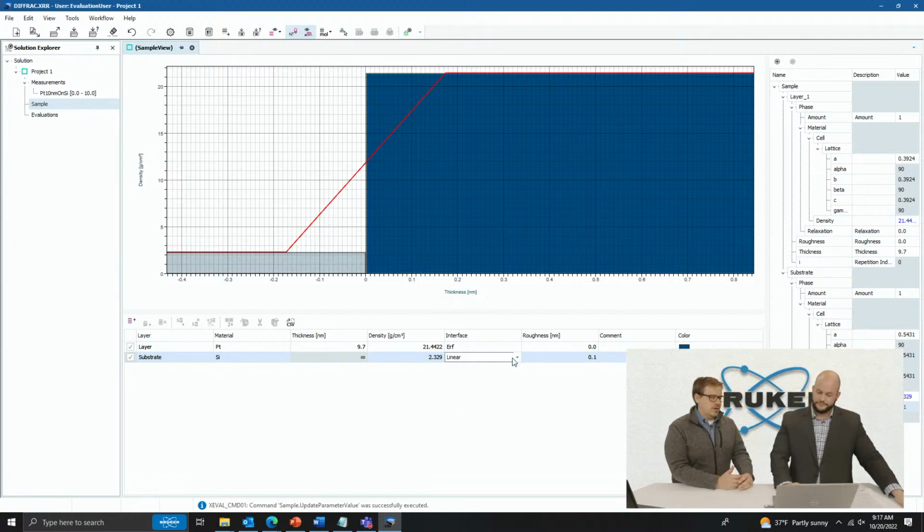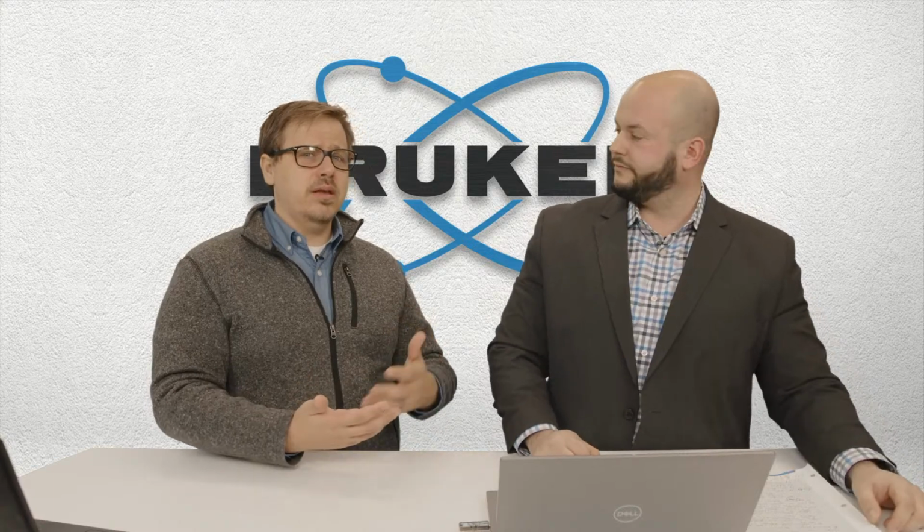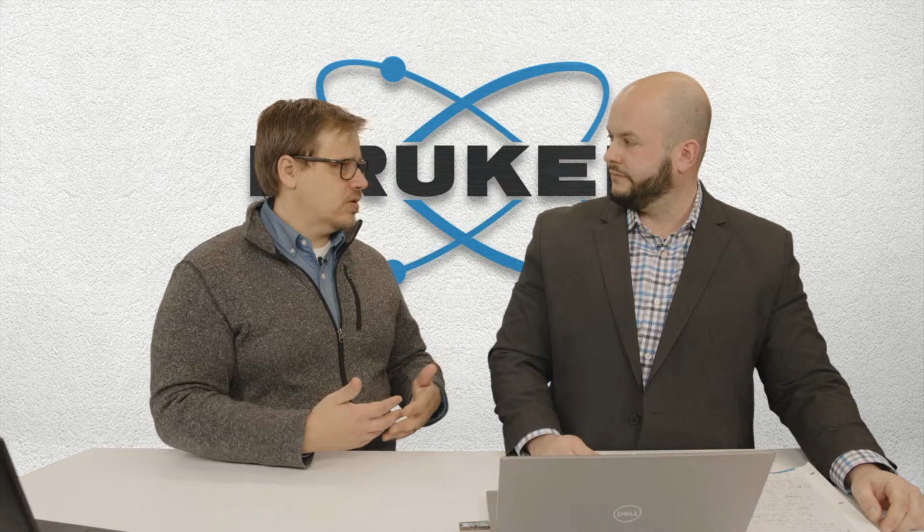You're mentioning density. Density is the simple way to think about this in terms of scattering. X-rays scatter off of something based on its electron density. There are other characteristics in there too, though, things like absorption and such.